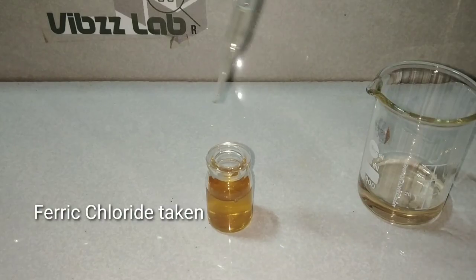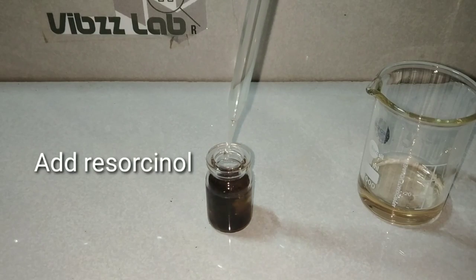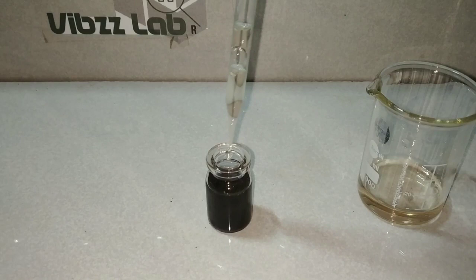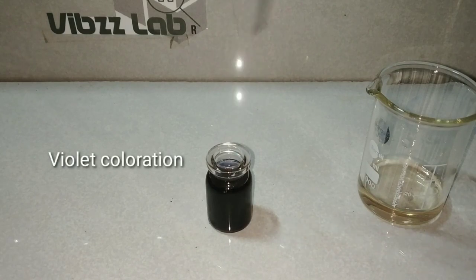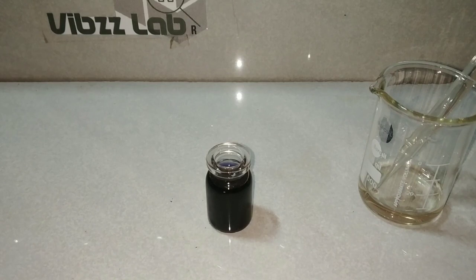On adding resorcinol to ferric chloride solution, we get a purple colored complex. This reaction is similar to ferric chloride reacting with phenol. Since resorcinol also has a phenolic group, it gives this test.